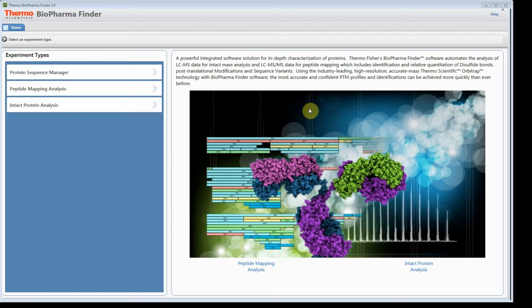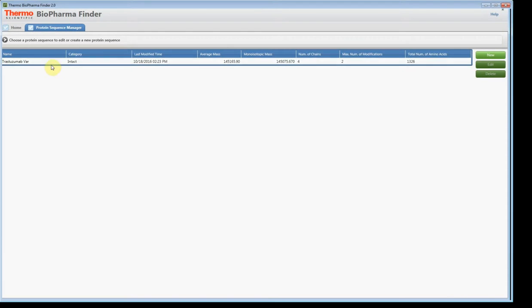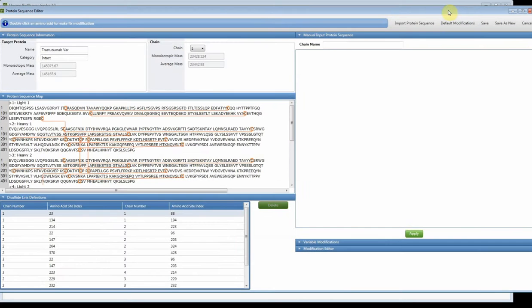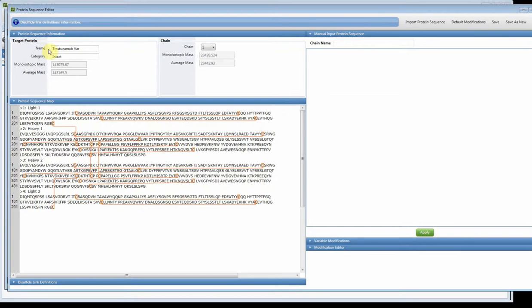Here's the home page for Biopharma Finder 2.0, and we're going to begin with Protein Sequence Manager. I've already imported the protein sequence to save time, but I'll go over what you need for the intact analysis. When you bring in your protein sequence for intact analysis, you want to make sure that you have the appropriate number of chains for antibodies. Here we have one copy of the light chain, another copy of the light chain, and then two copies of the heavy chain.